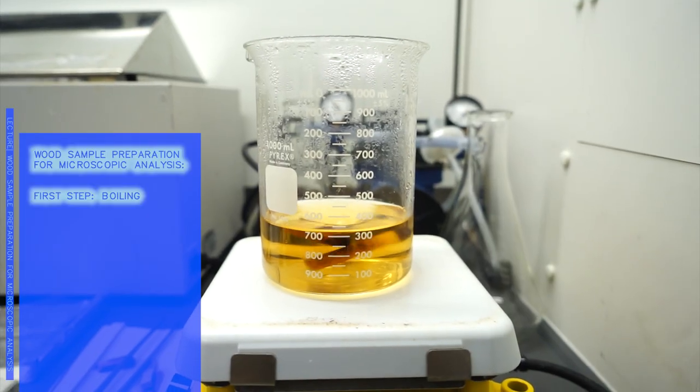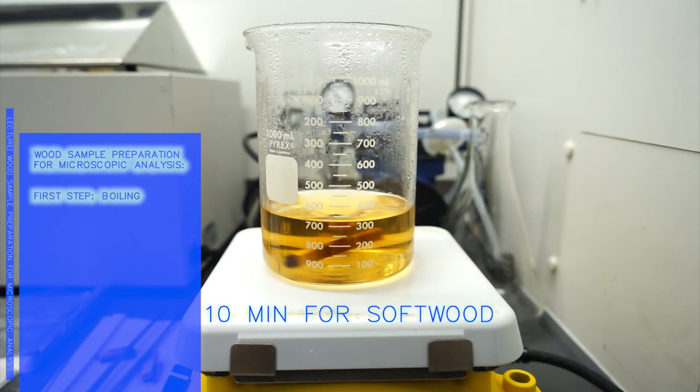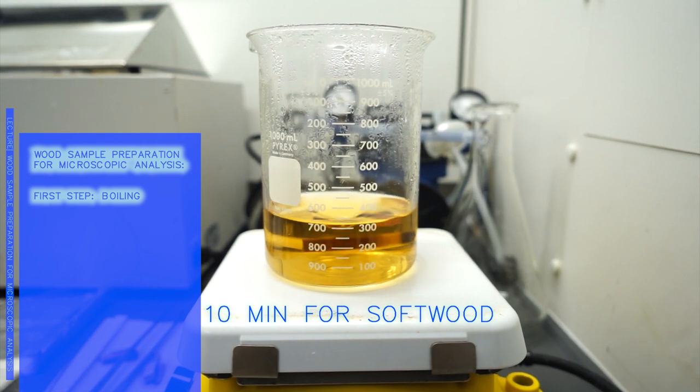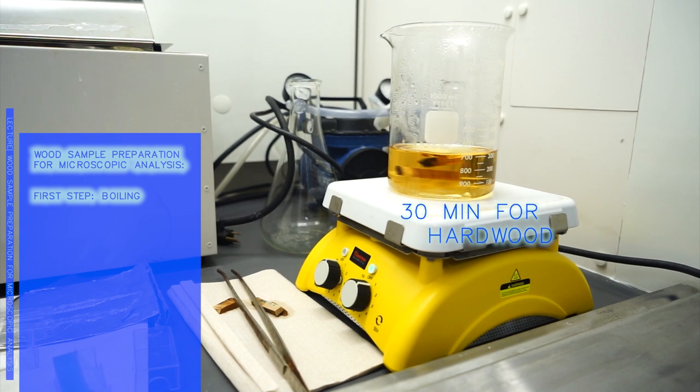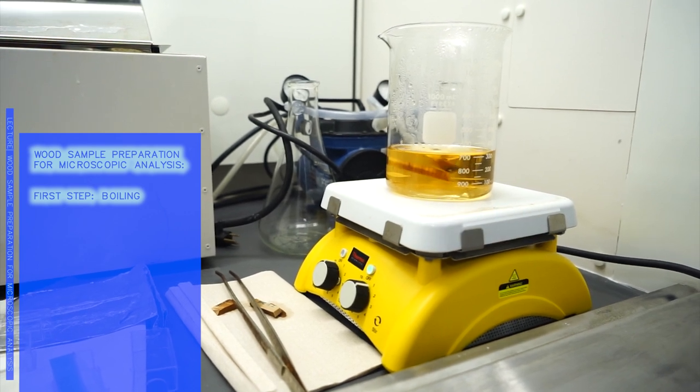The very first step that we have to take with the wood that we are going to cut to get our anatomical sections is to boil it. The classic and standard way to do it, around 10 minutes for softwoods and probably around half an hour for some of the hardest hardwoods that we have out there.